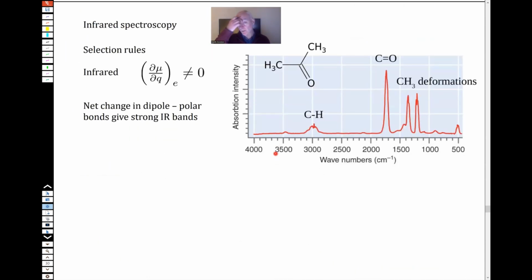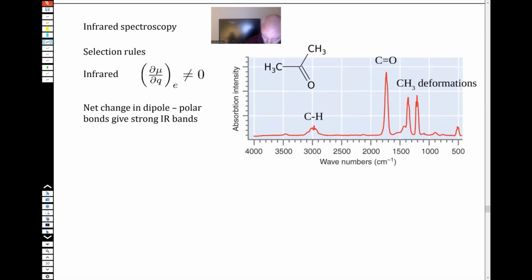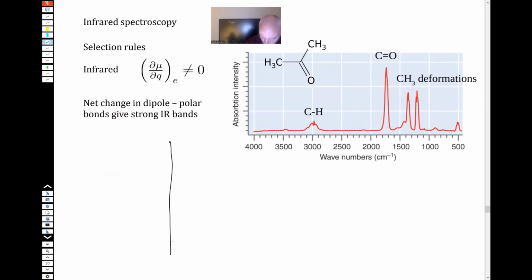What about what makes these things tick? Why do the spectra look different? Well, let's start with one that we should, I hope, know, and that's infrared spectroscopy. So many of you will remember that you can think about these in the following way.